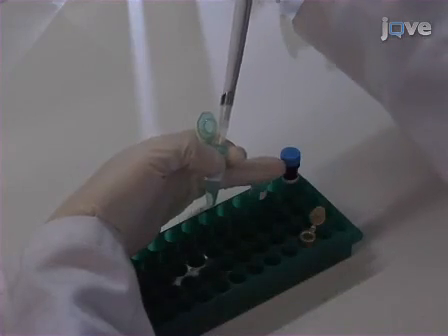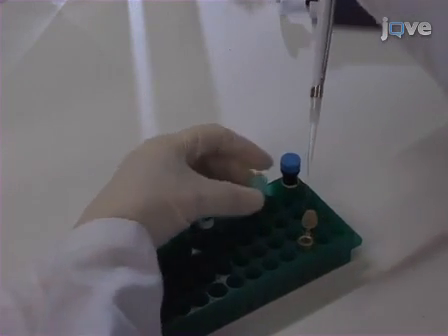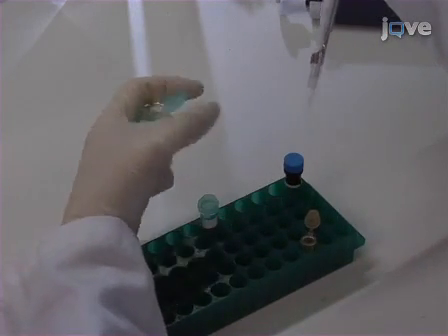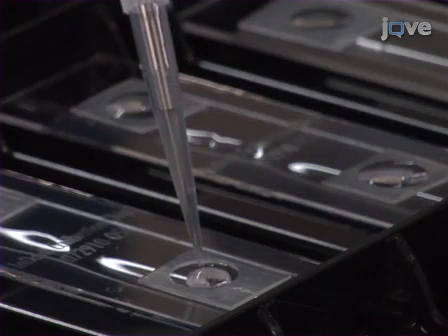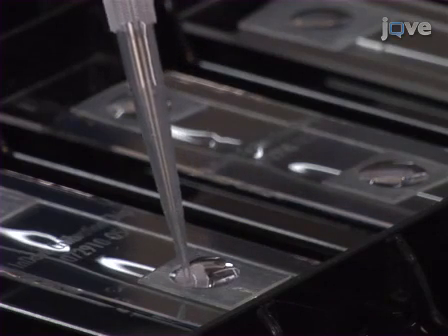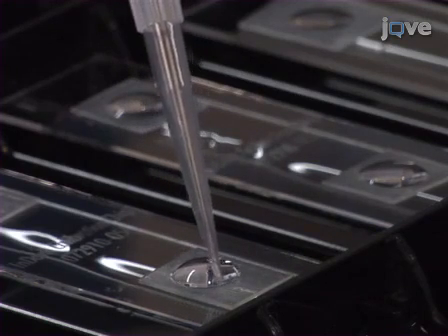Combine 10 microliters of AmpliTag, 20 microliters of 2X AmpliTag buffer, and 10 microliters of purified water for each array to be processed. Transfer 40 microliters of label mixture to each array and allow the labeling reaction to proceed in a closed humidity chamber for 5 minutes.